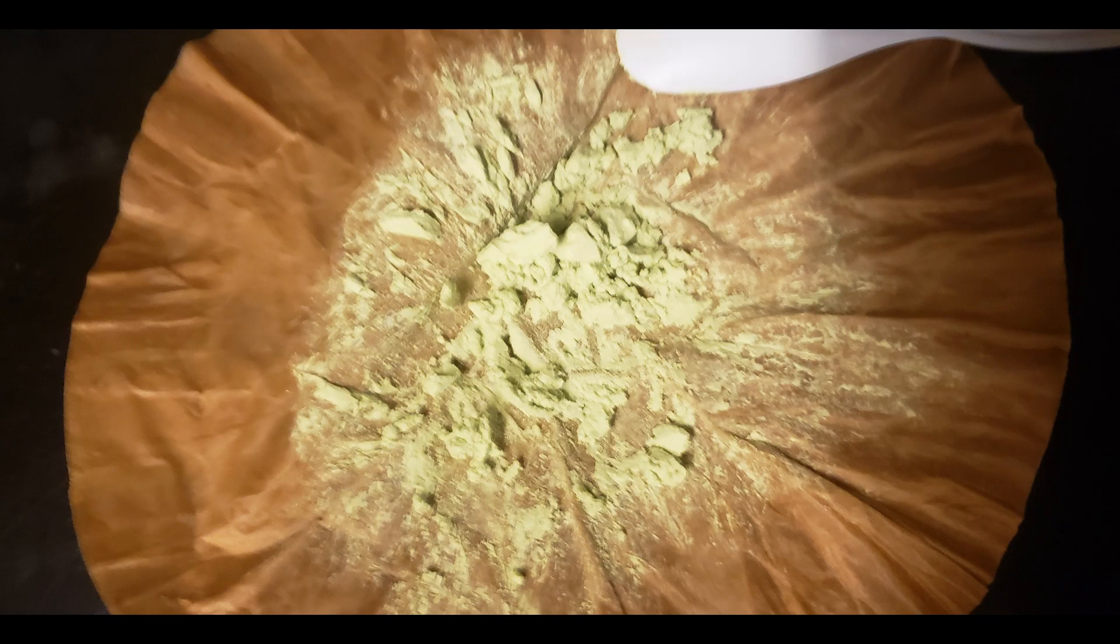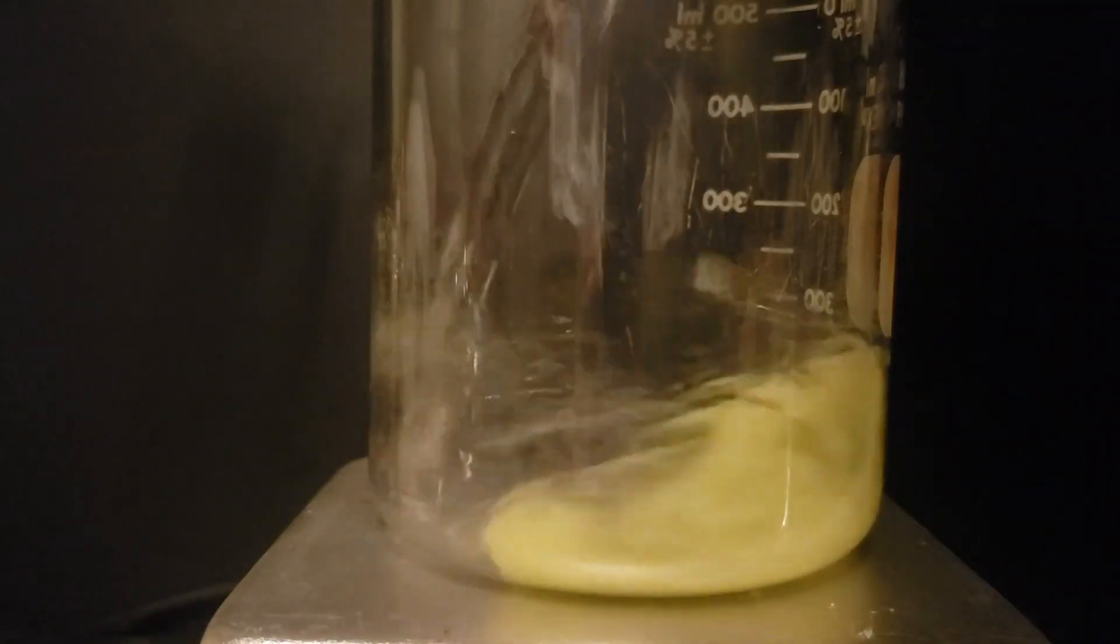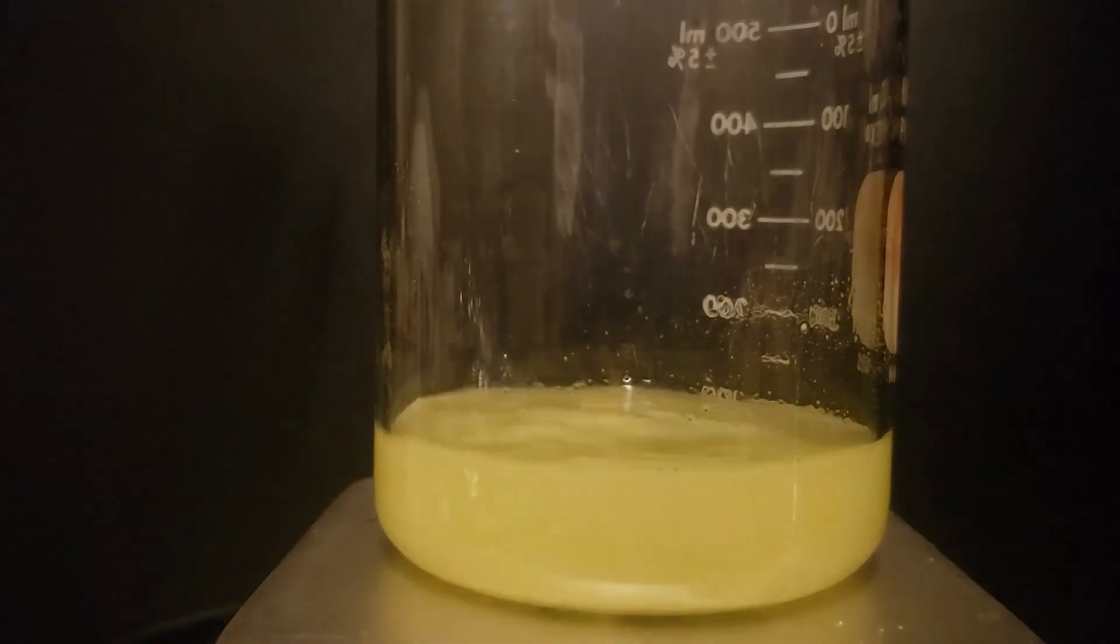I have obtained about 5 grams of a damp, greenish-yellow crude product. The crude product is then recrystallized from 120 ml of boiling acetone.